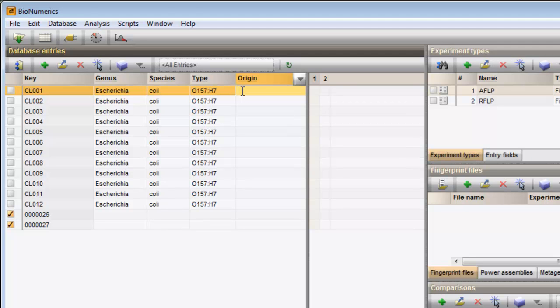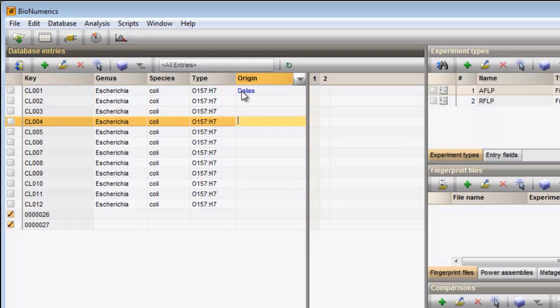The information field will appear highlighted and information can be added. With the arrow up and down buttons, I can move through the entries in the database.